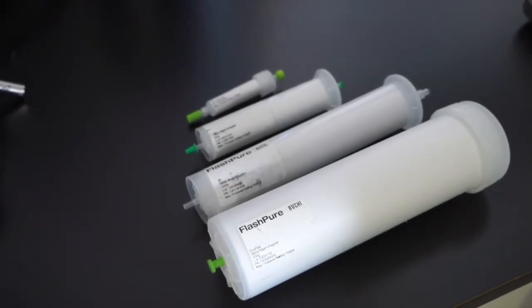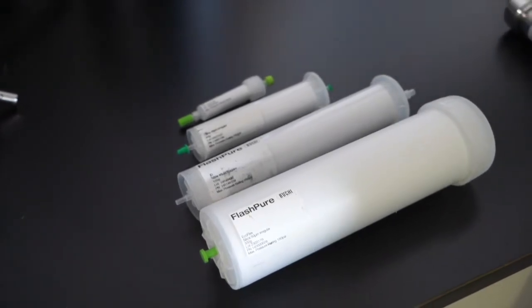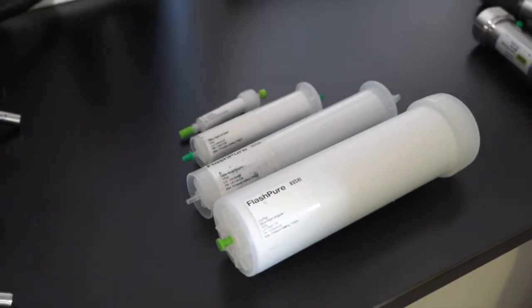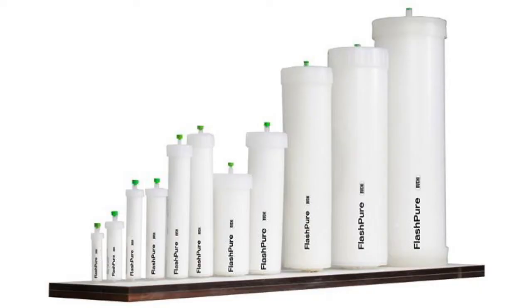Buchi offers flash cartridges in a wide variety of sizes covered in different stationary phases, such as silica, C18, alumina, amino, and diol. The cartridges come in various particle sizes and geometries, irregular and spherical. For everyday separation, we recommend 60 micron or 40 micron range. And for complex separation, we offer 15 microns.